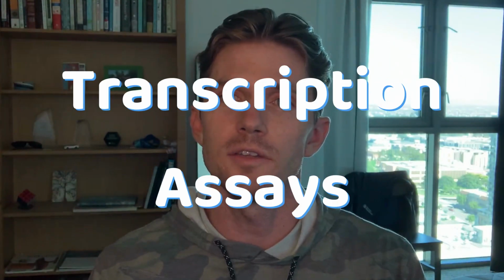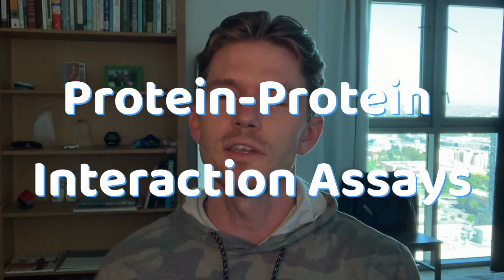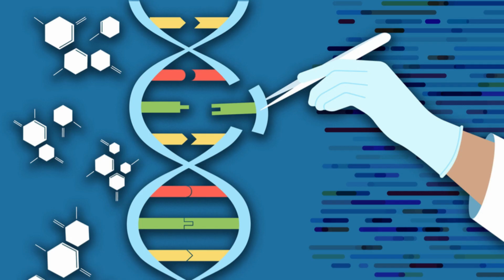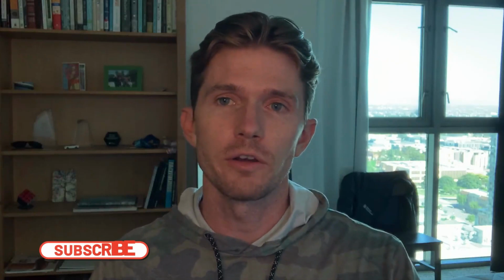Hey guys, today I'm going to talk about transcription assays, protein-protein interaction assays, and DNA-protein interaction assays. These assays can be really important because they can tell you exactly what is being transcribed, which genes are being transcribed in a cell, what proteins are interacting with certain DNA sequences, and what proteins are interacting with each other.